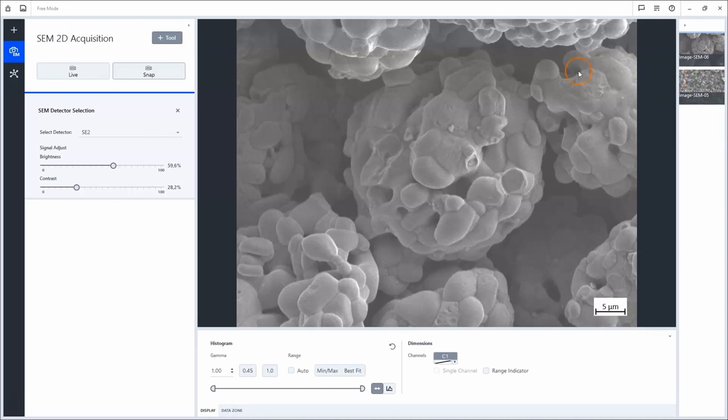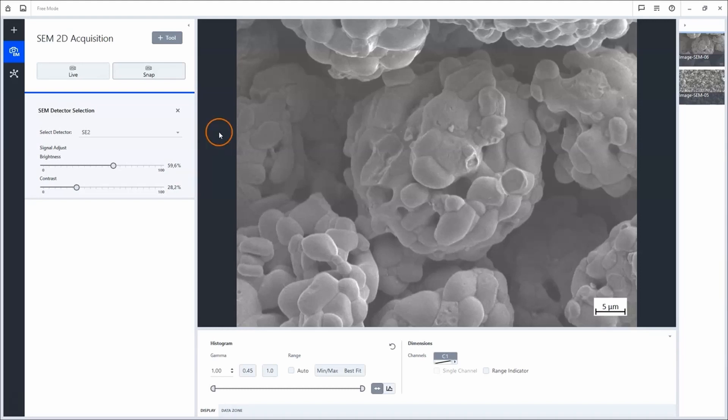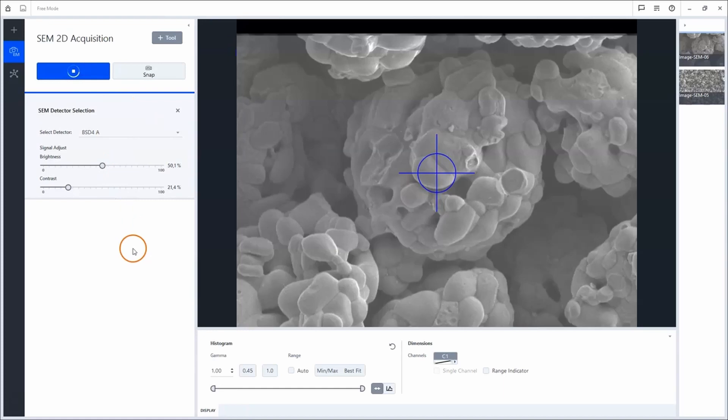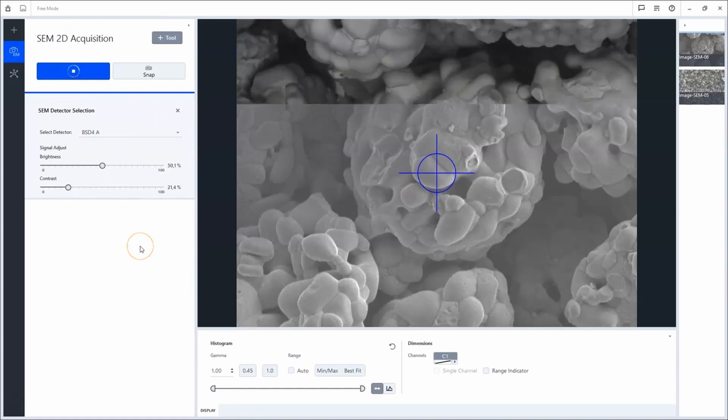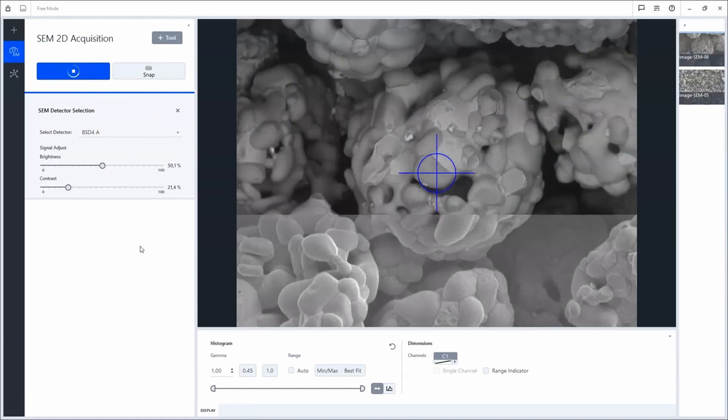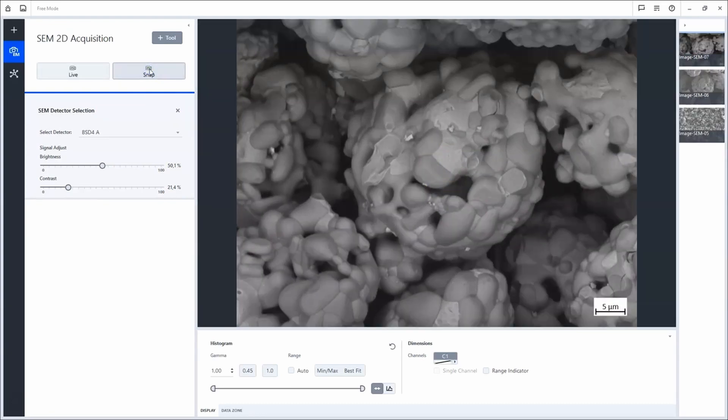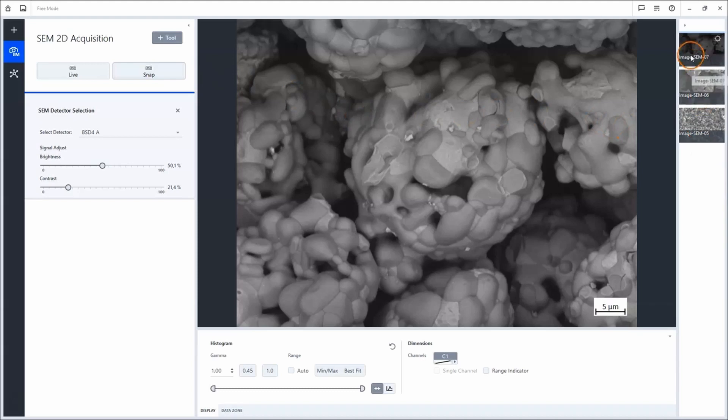In the next step, I will use the Backscatter detector to acquire a material contrast image. Click Snap again. Both images are visible in the image gallery now.